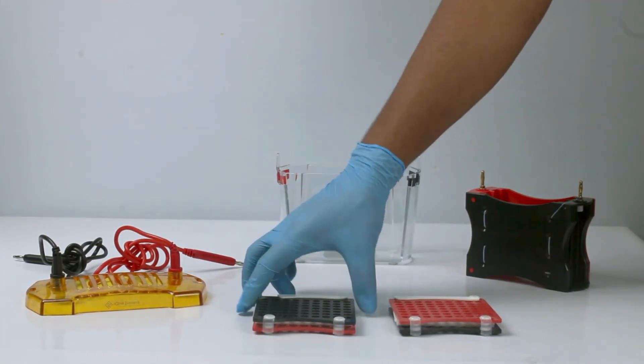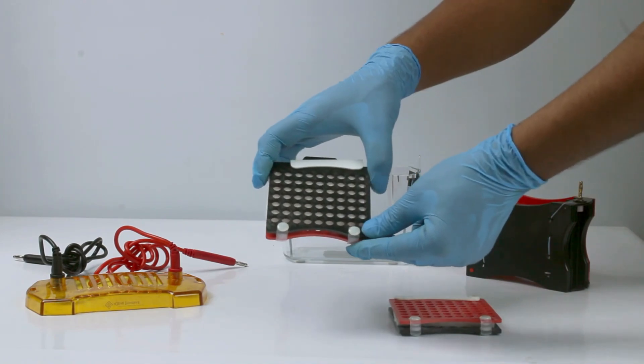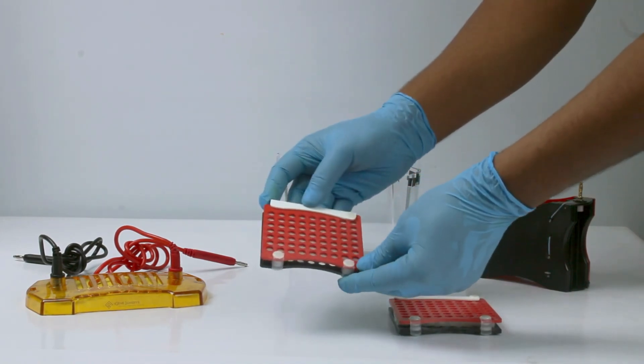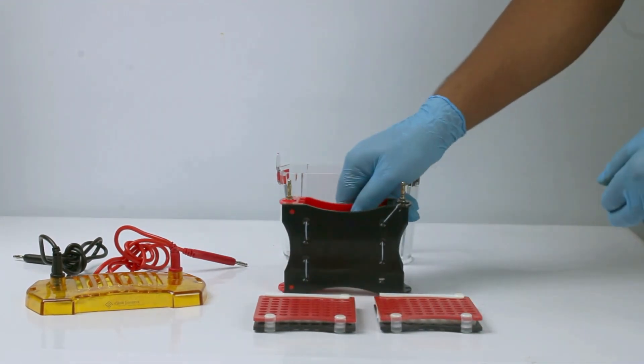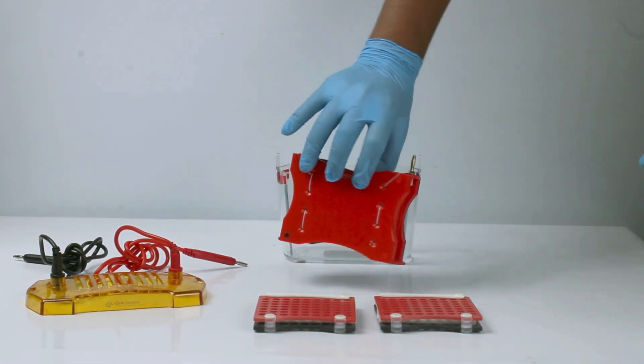Let us move to the western blot procedure. Use the transfer clip with color-coded marking. Black indicates negative side, red indicates positive side. This is our transfer blot with color coding.